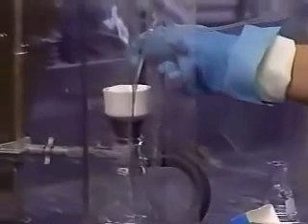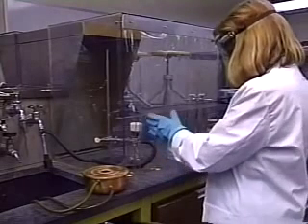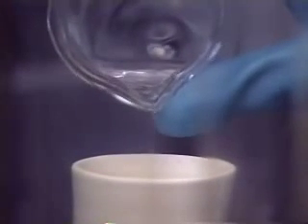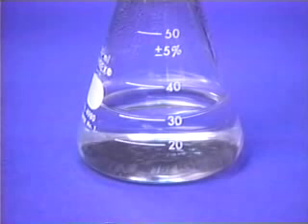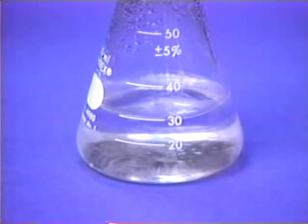Place a small piece of filter paper inside the Buchner funnel. Pour a small amount of cold solvent through the filter to ensure a tight fit against the holes of the funnel. Crystals of benzoic acid form as the solution cools to room temperature.